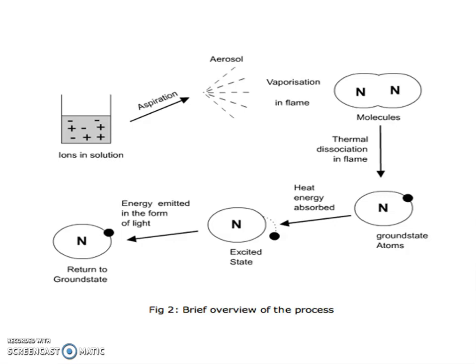Ions in solution. Here, aspiration, aerosol, vaporization in flame, molecules, thermal dissociation in flame, ground state atoms, heat energy absorbed, excited state, energy emitted in the form of light, return to ground state.